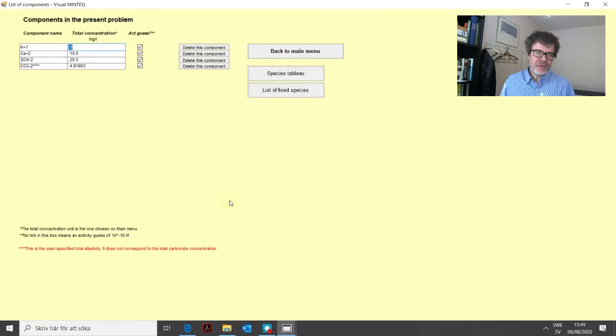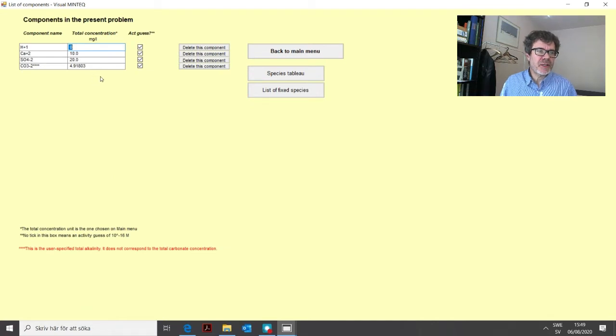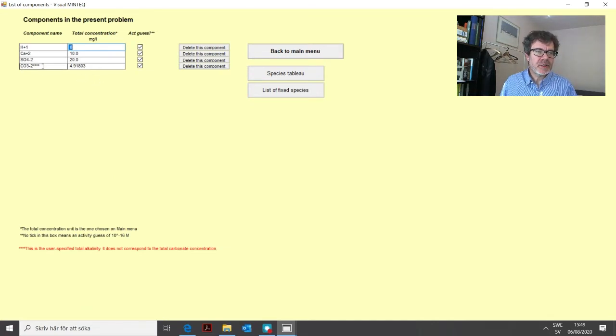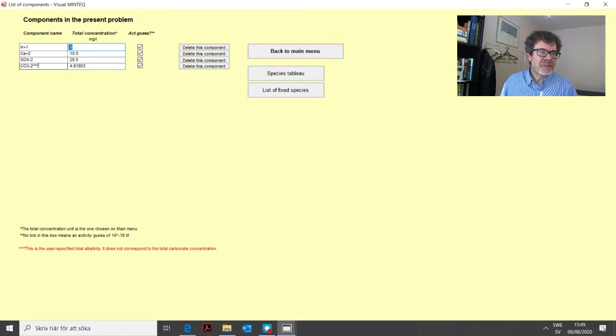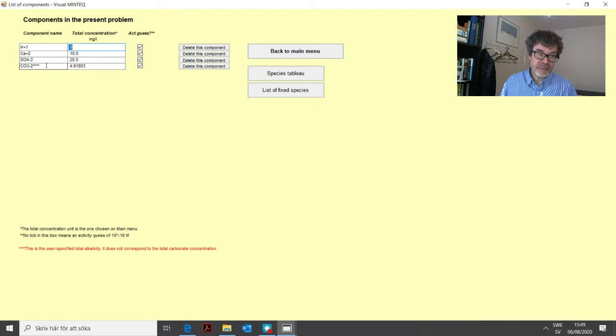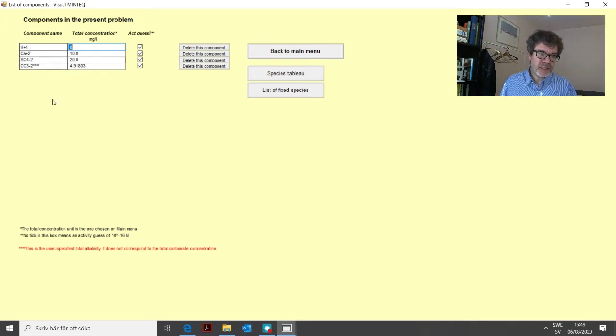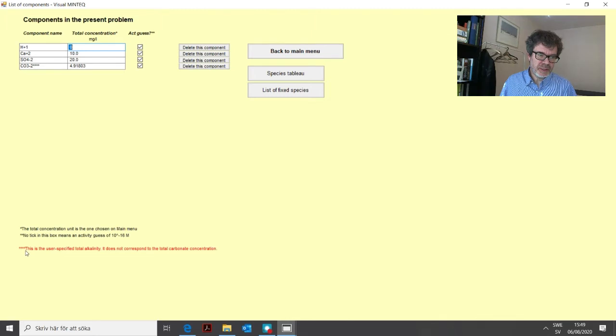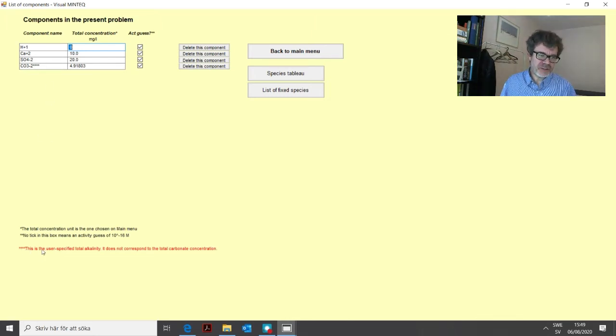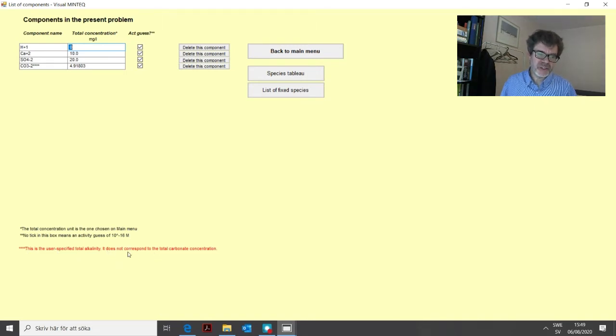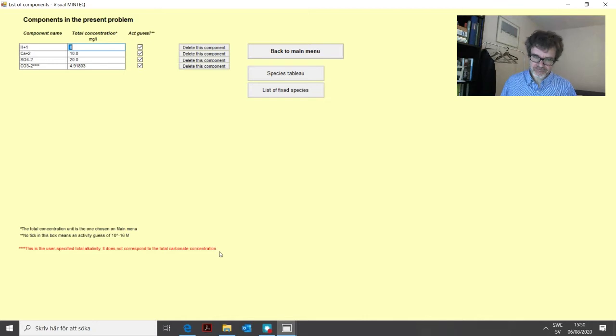Now we have added alkalinity. And if you click this component list again, you can see here that we now have carbonate as a component, but with four stars. And this is a special component when we have alkalinity defined. And you can see here below the table, the explanation or the legend for these four stars. So this is a user-specified total alkalinity. It does not respond to the total carbonate concentration.